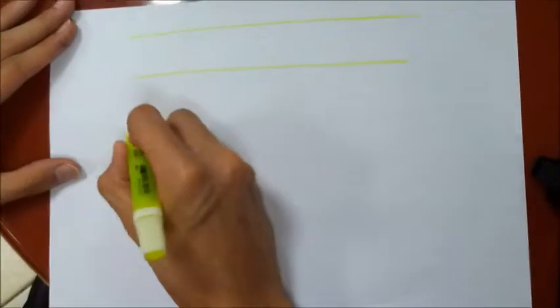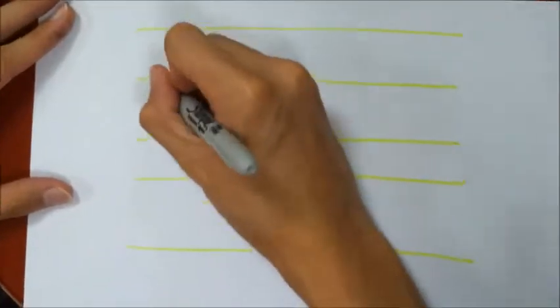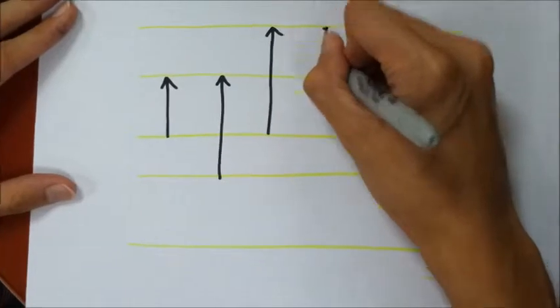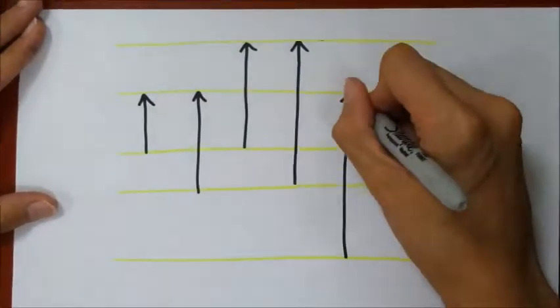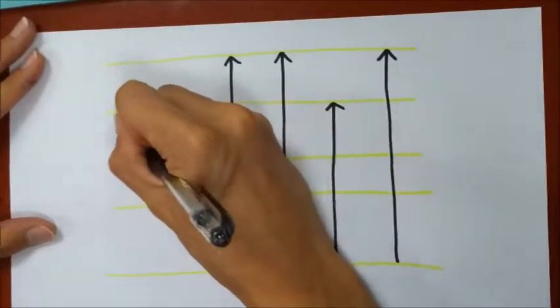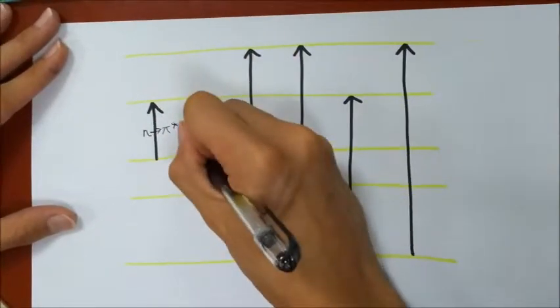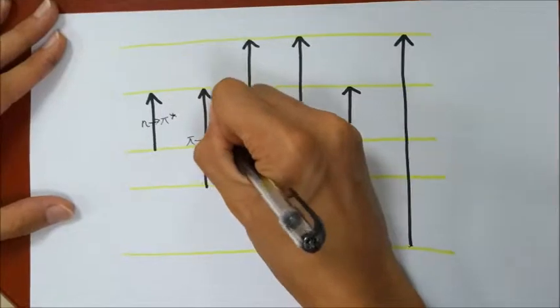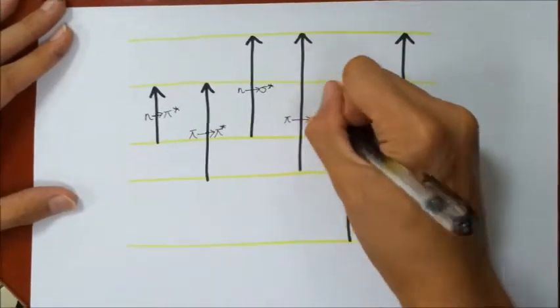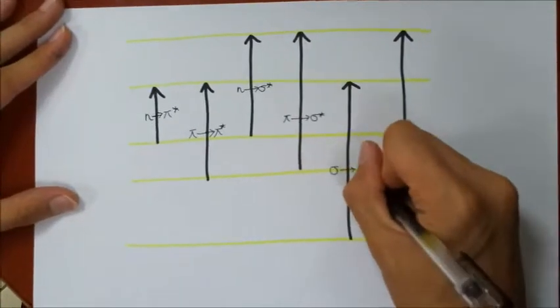Absorption spectroscopy carried out in this region, which is visible or near ultraviolet, is sometimes called electronic spectroscopy. The diagram drawn shows the various kinds of electronic excitation that may occur in organic molecules. Of the 6 transitions outlined, only the 2 lowest energy ones, which are the leftmost, ticked in red color, are achieved by the energies available in the 200 to 800 nanometer spectrum.